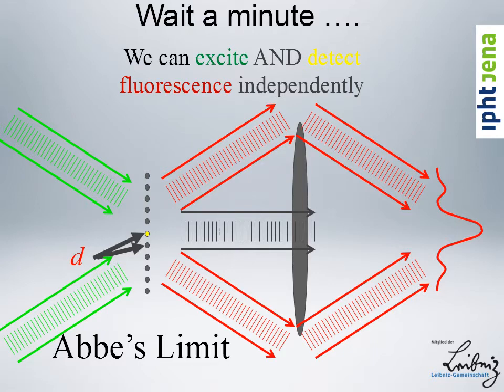And this is a very crucial point, that this can only be done for fluorescence microscopy. In Abbe's sense, for transmission light microscopy, no chance, because if you did that, the amplitude pattern would emerge here in a coherent situation, and putting a second amplitude here would just give you a second amplitude pattern that would independently add to the old amplitude pattern, but it doesn't give you any higher resolution. It just gives you a different direction of resolution.